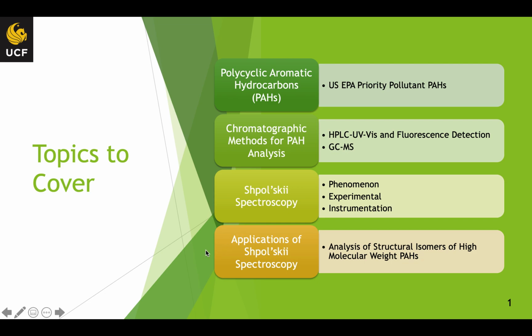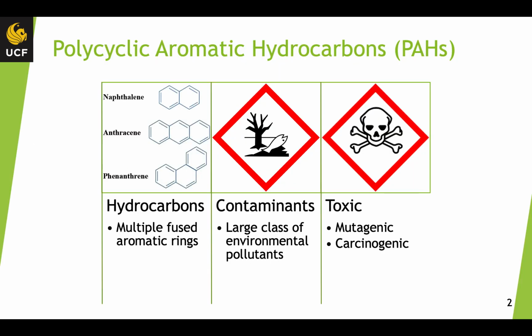And then I will lead into Shpol'skii spectroscopy, a little bit about the phenomenon behind this method, experimental procedures involved in this method, and the instrumentation used for these measurements. And then I will finish off with an application of Shpol'skii spectroscopy, which involves the analysis of structural isomers of high molecular weight PAHs.